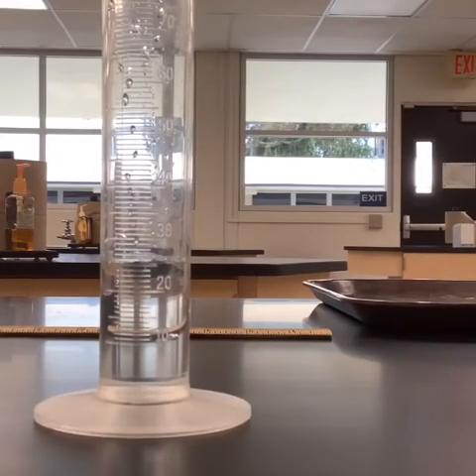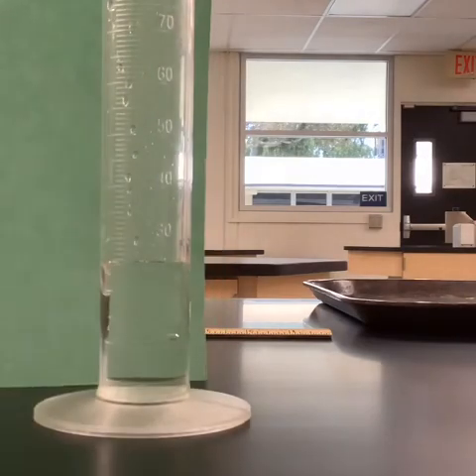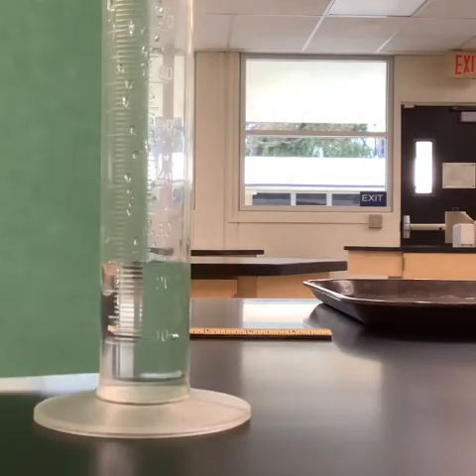So we're looking at the graduated cylinder here. We're going to be using this graduated cylinder to find the volume of our rubber stopper now that we have the mass. So you'll notice that there's some liquid in the graduated cylinder already. The liquid, when you first glance, is a little bit hard to see, but the level is sitting right here. I'm going to put a piece of paper behind it a little bit. Sometimes that helps us just grab it with the eye. You can kind of see where it's at.